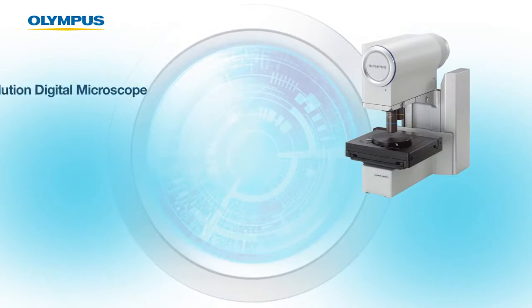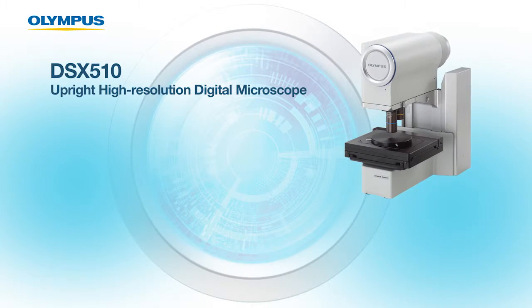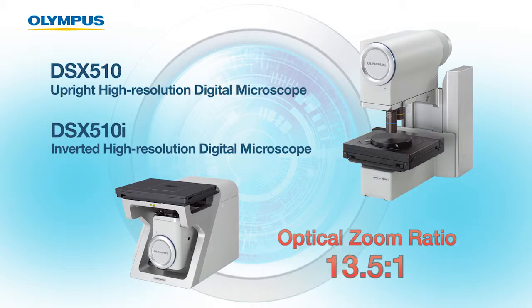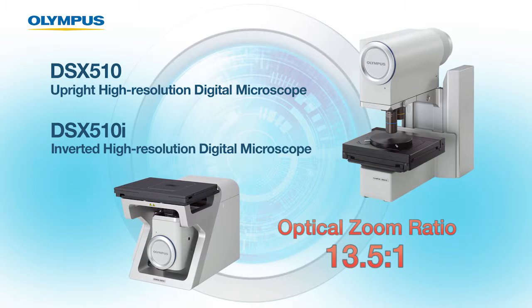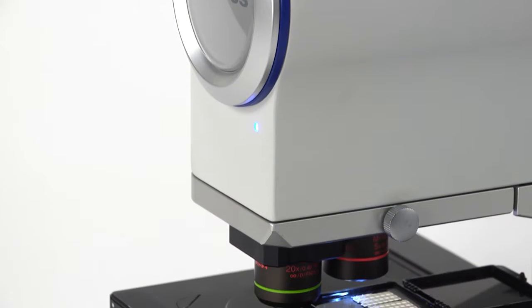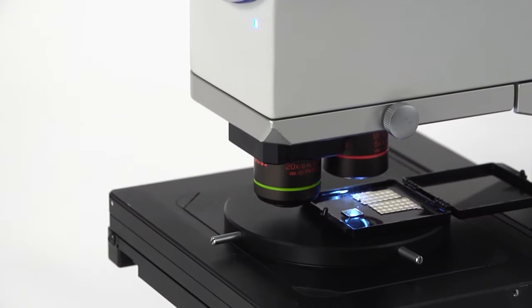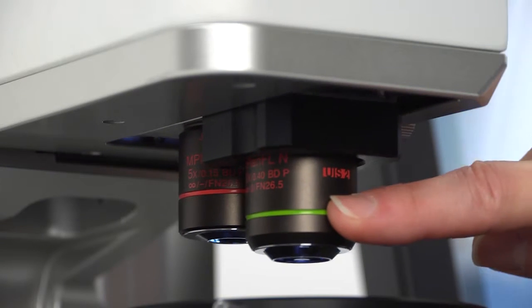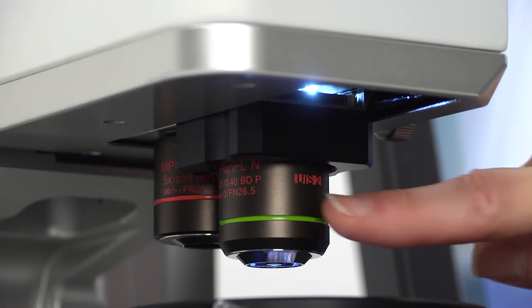The DSX 510, the high resolution upright microscope, and the DSX 510i, the high resolution inverted microscope, both have an optical zoom ratio of 13.5 to 1. In addition to the internal optical zoom, the DSX 510i allows the user to change between two external par-focal objectives in real time. These external lenses considerably extend the optical zoom.